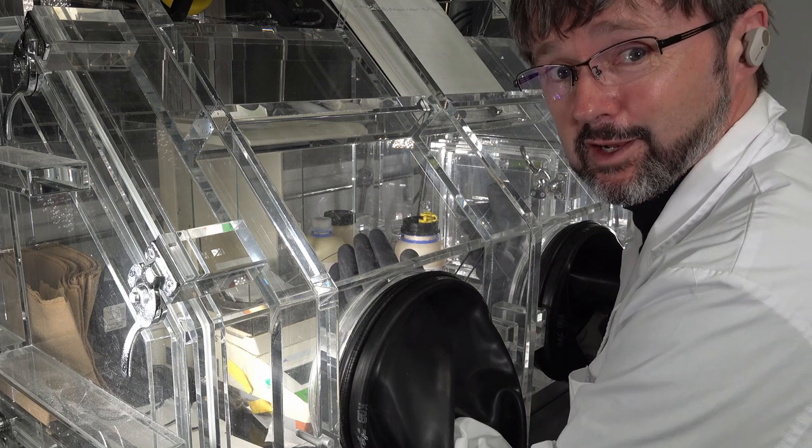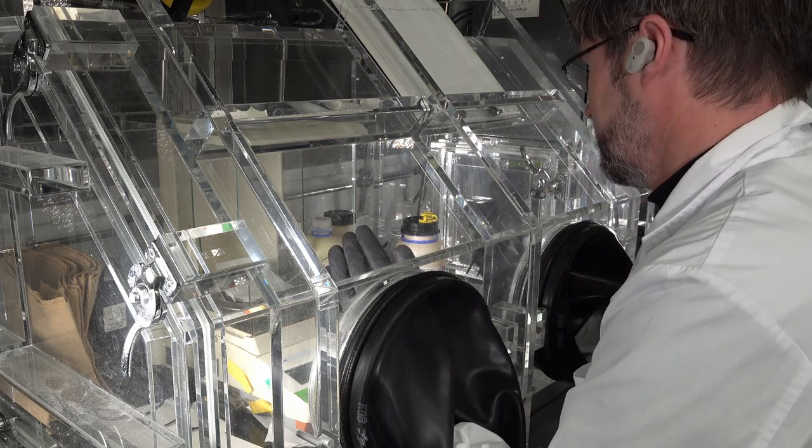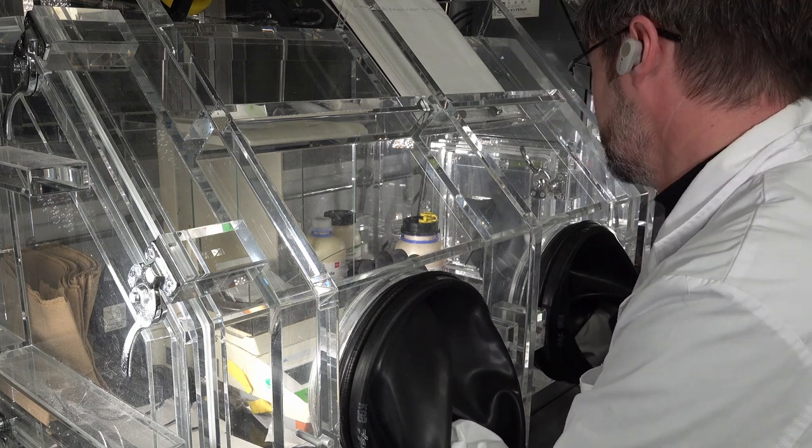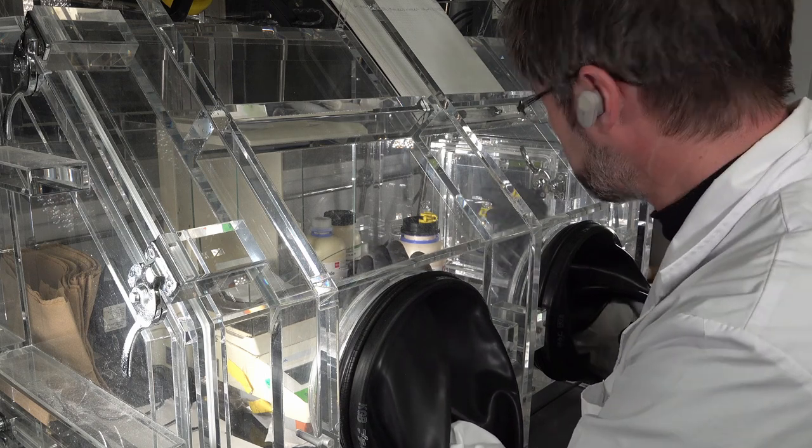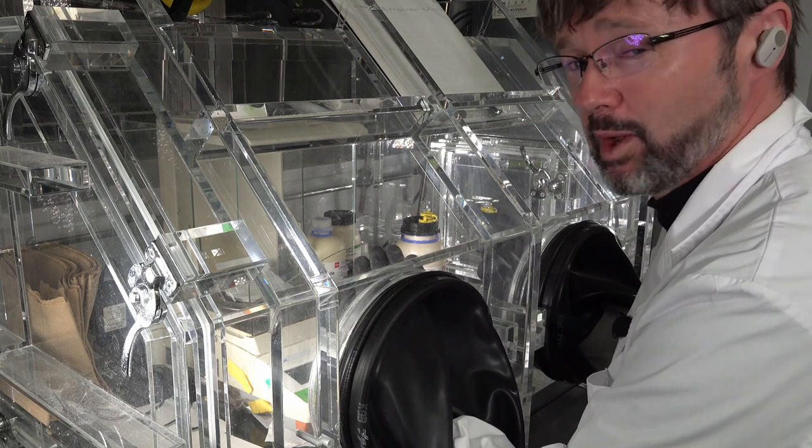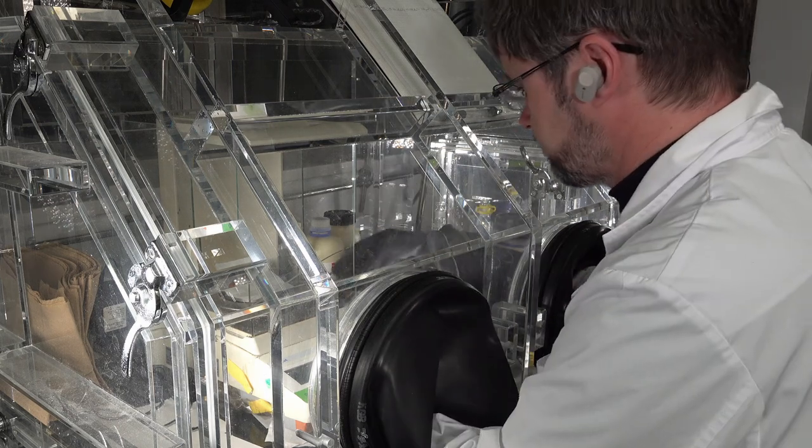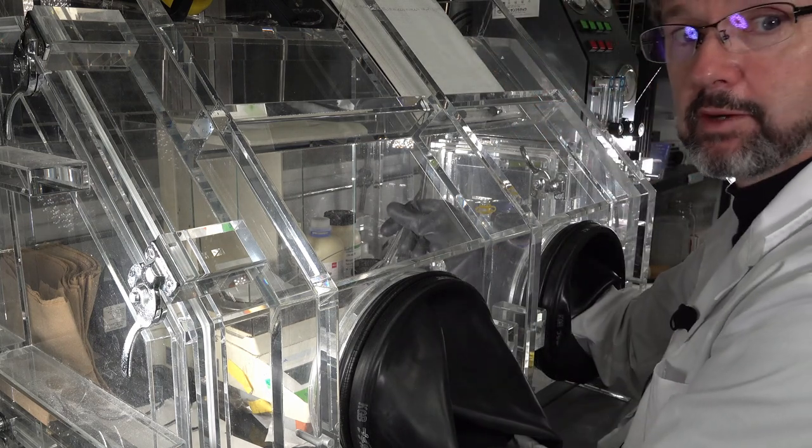I've left my syringes out of the glove box, which is a real pain in the bum because I'm gonna have to take everything off, put it all through the pass box there again, and blah blah blah. What a load of hassle. I hate these things. Okay, so let's make up my buffer.